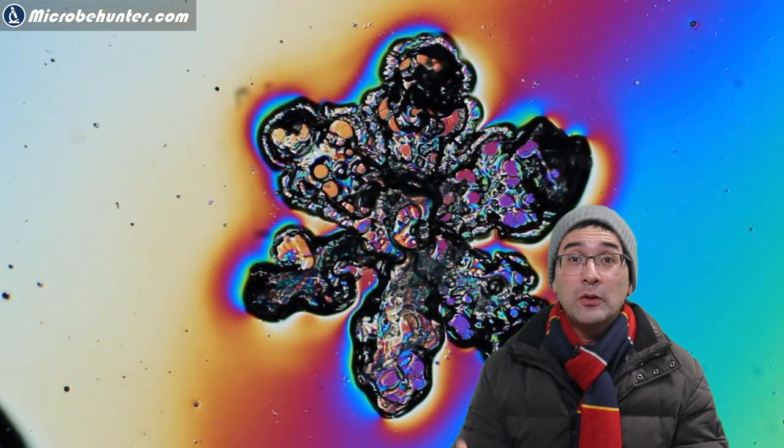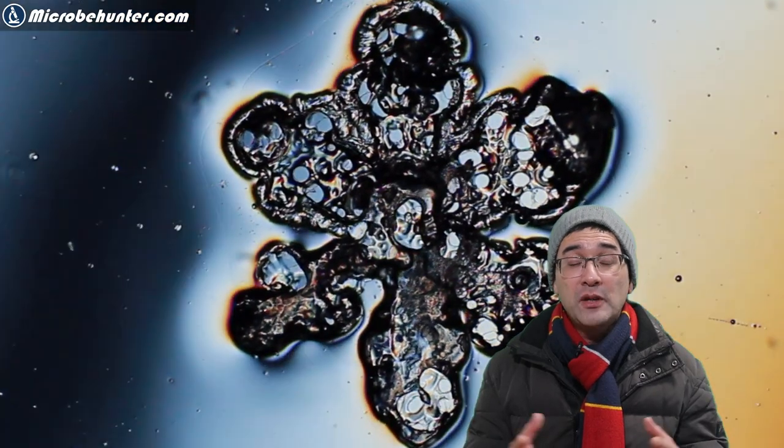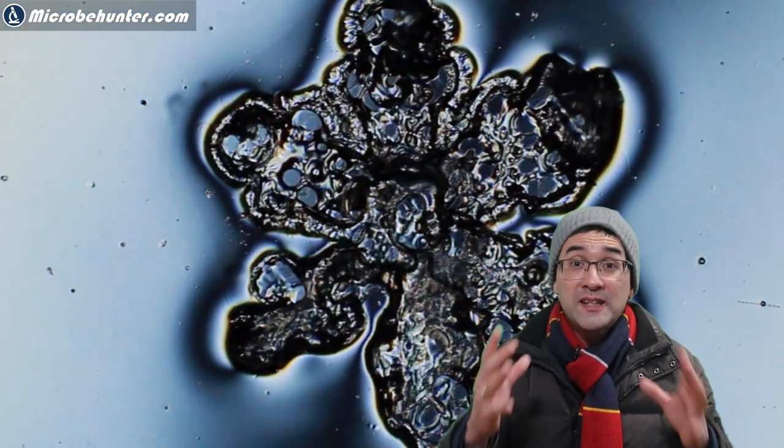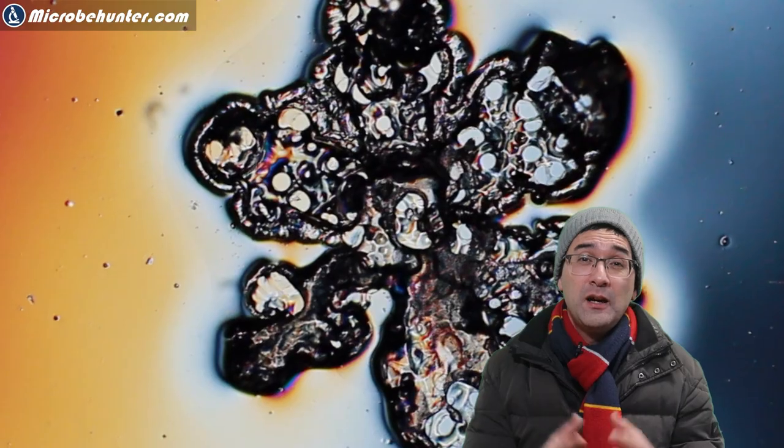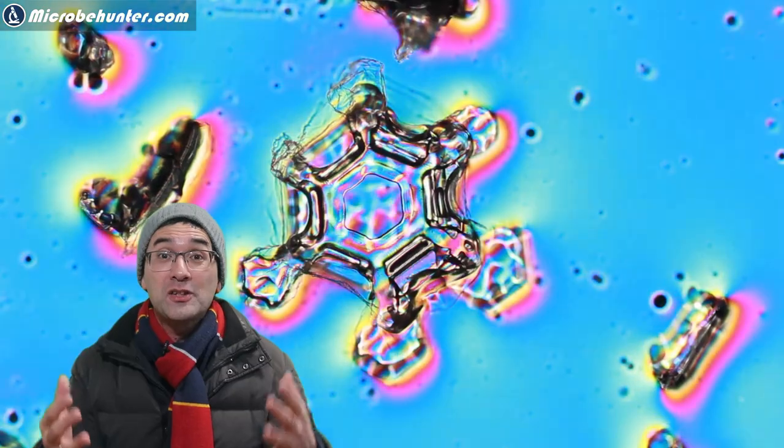It started to snow. I quickly caught the snow on those six slides that I showed you before and I was able to find around three or four of those hexagonal snowflakes. Unfortunately not more. I wanted to show you more and I wanted to make more, but unfortunately it stopped snowing.